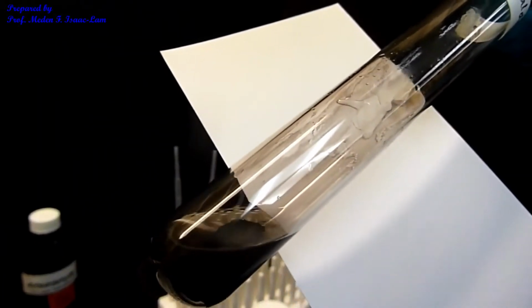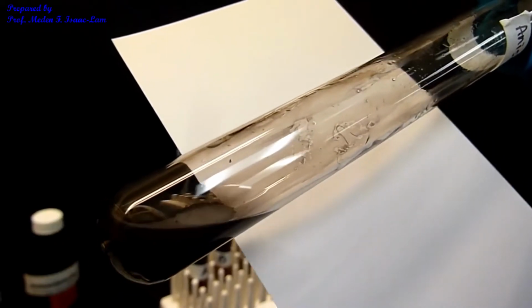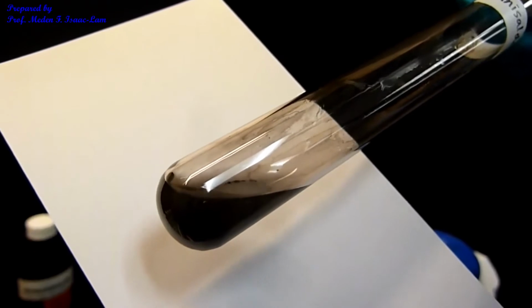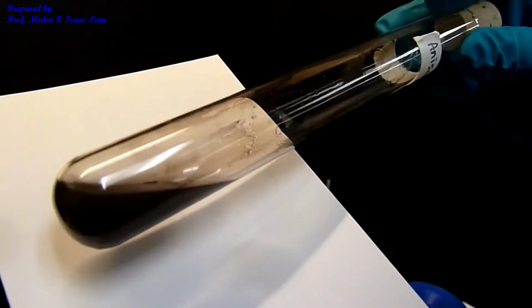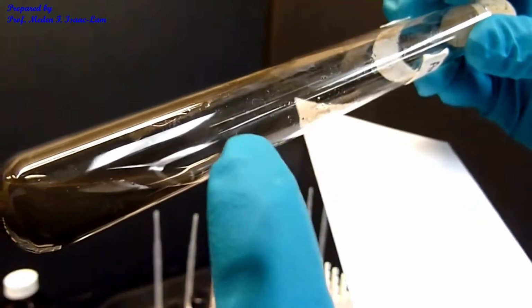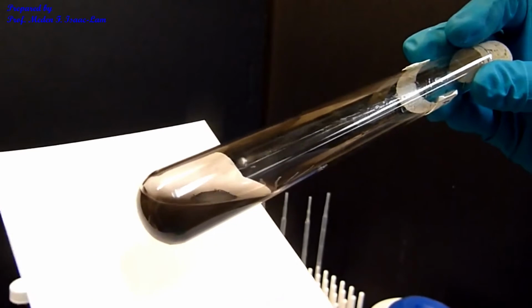So you can see that the side of the tube actually has a silver kind of precipitate, which is indicative of the silver zero and the change in the appearance. And on the tube you can see also the shiny silver zero. So this is the standard.